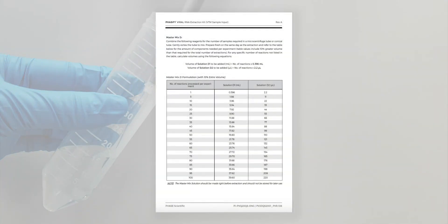Then, prepare Master Mix D by adding solution D1 and solution D2 into a microcentrifuge or conical tube. Refer to the Master Mix D formulation table found inside the kit to determine the exact volume of each reagent you should add depending on how many samples you intend to process.